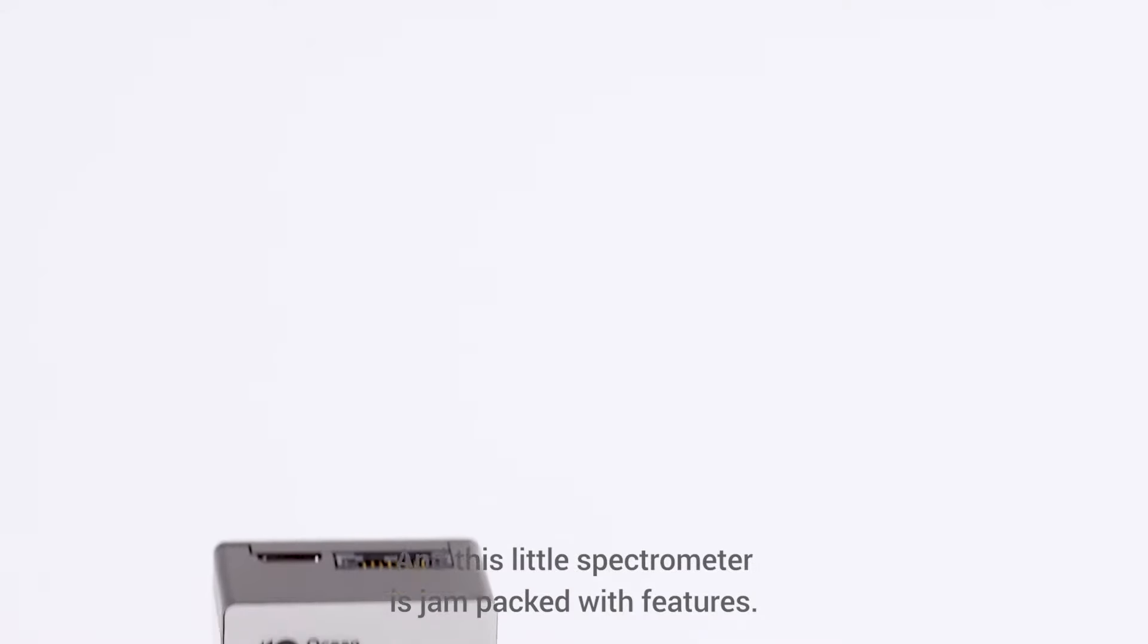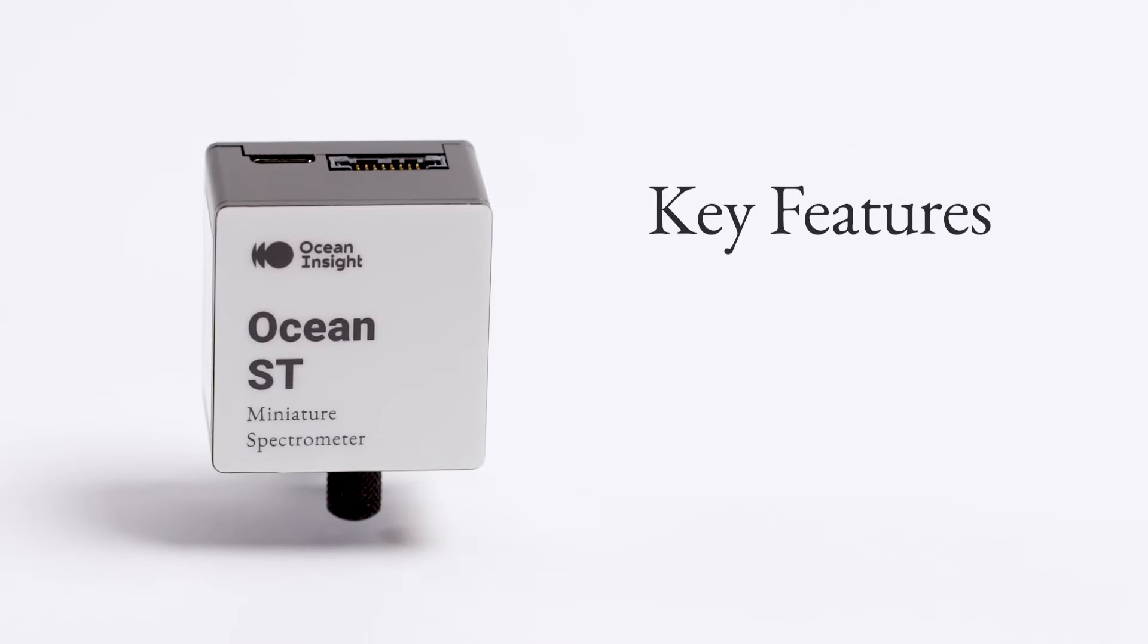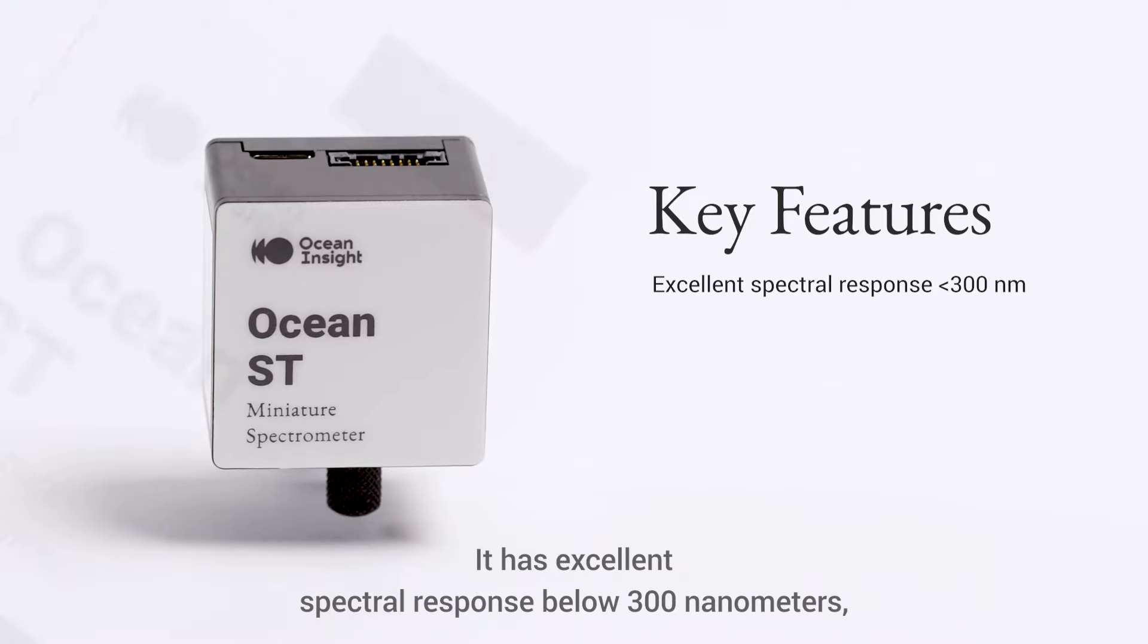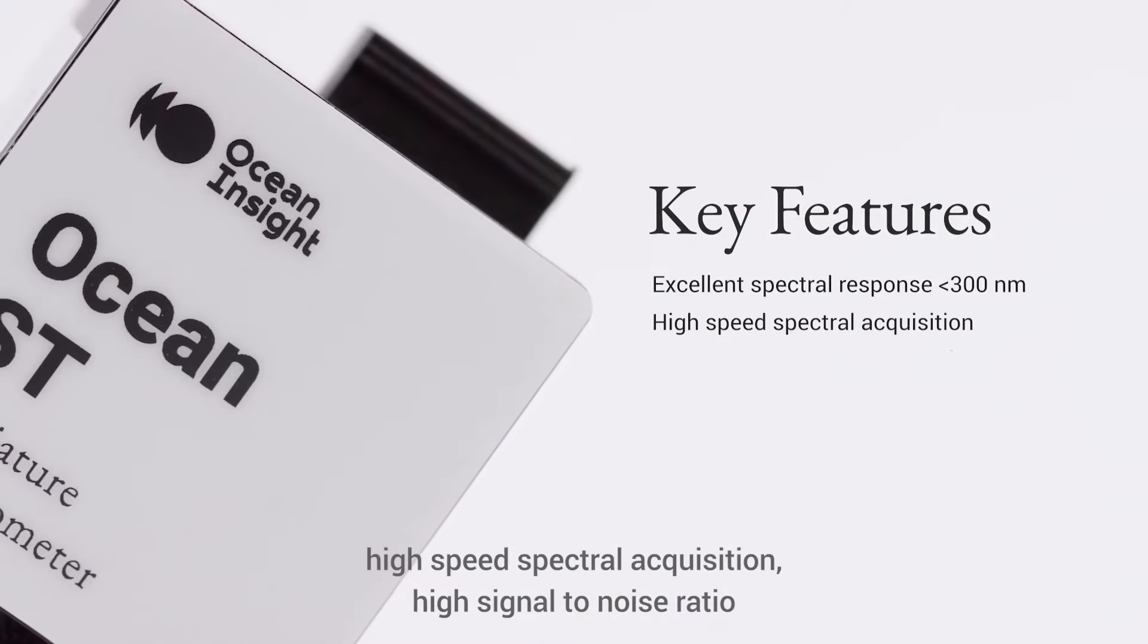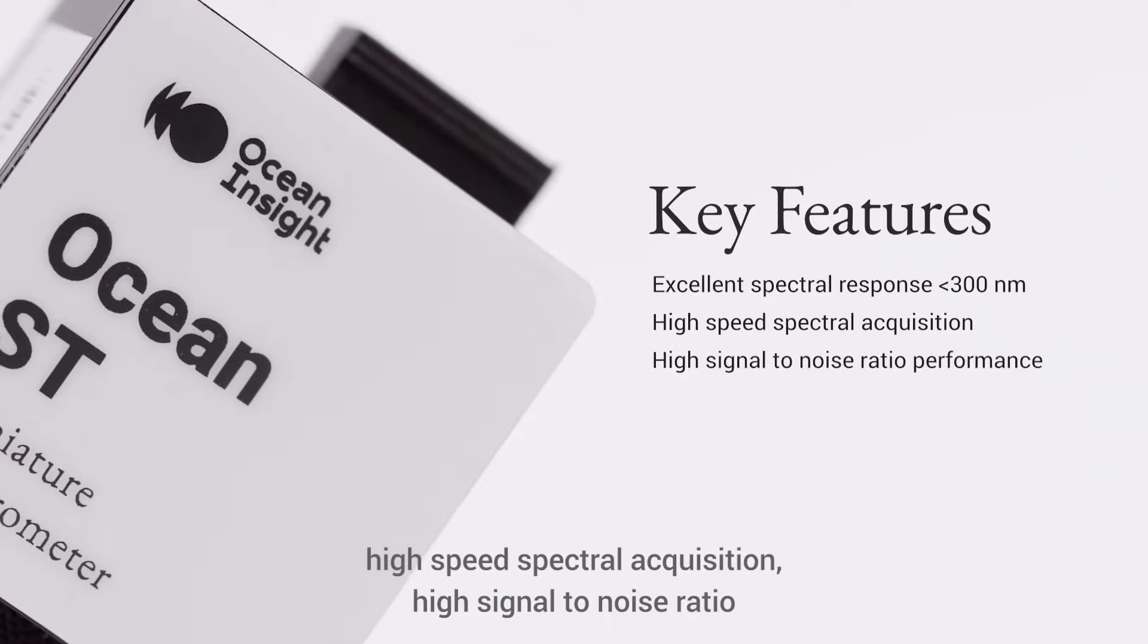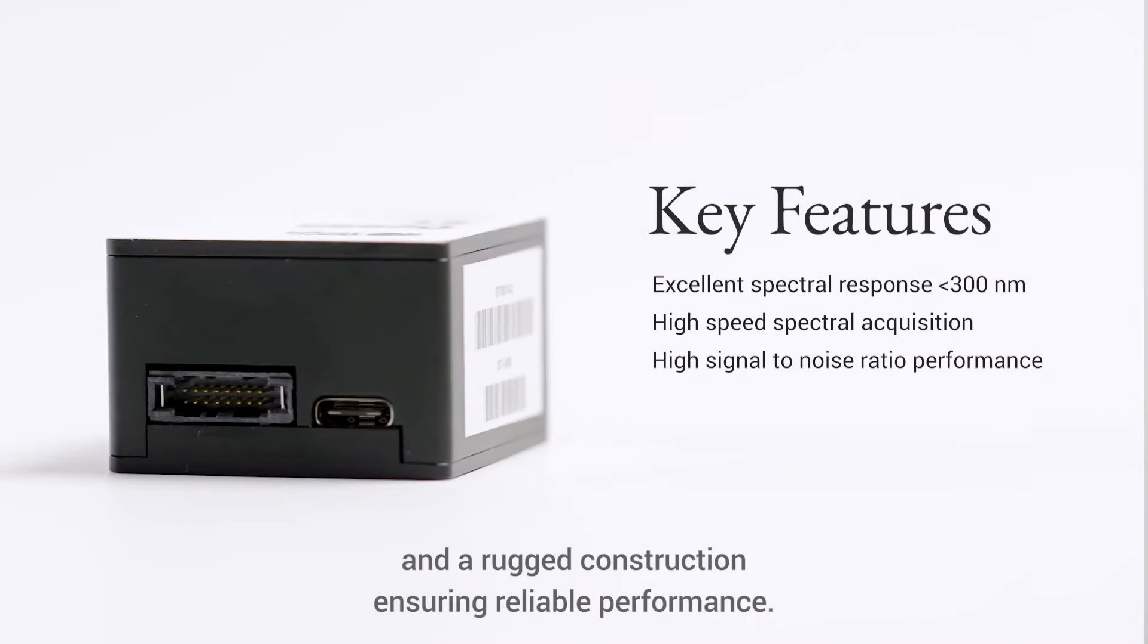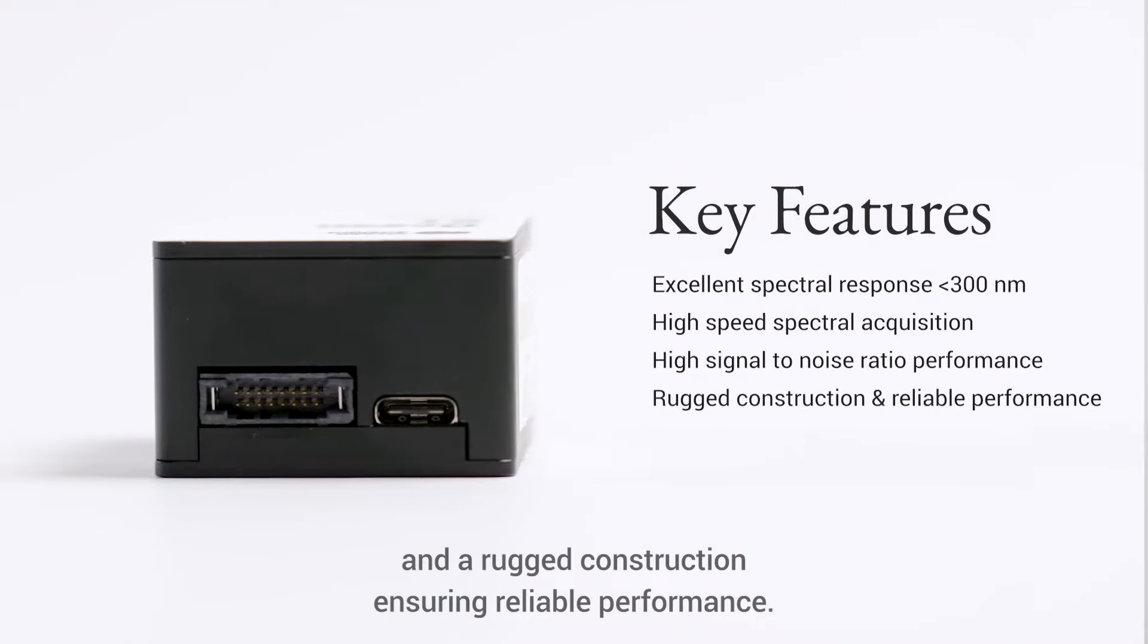And this little spectrometer is jam-packed with features. It has excellent spectral response below 300 nanometers, high-speed spectral acquisition, high signal-to-noise ratio, and a rugged construction ensuring reliable performance.